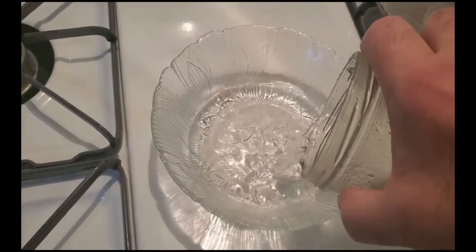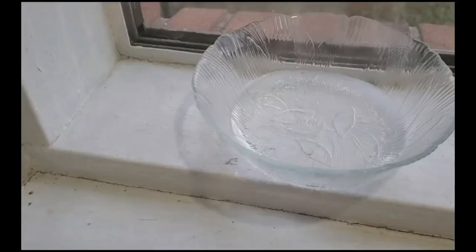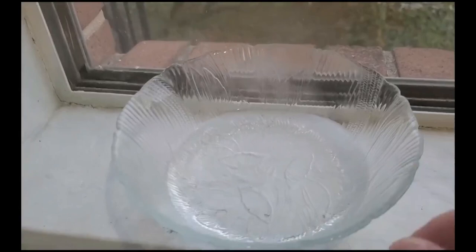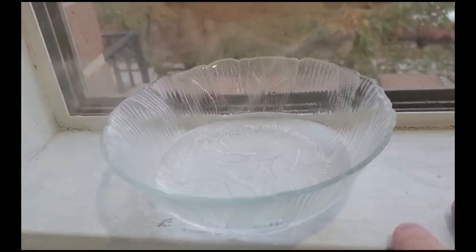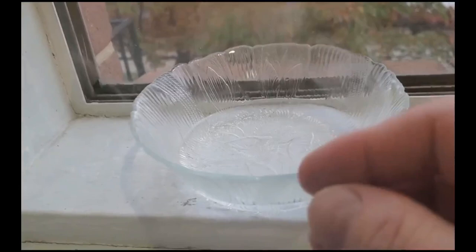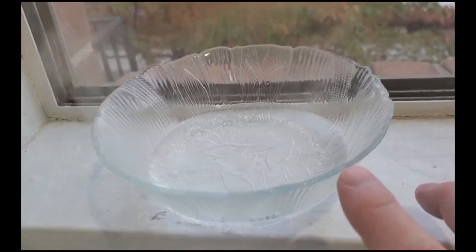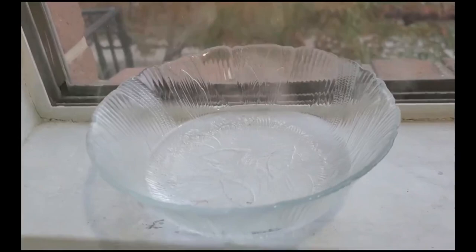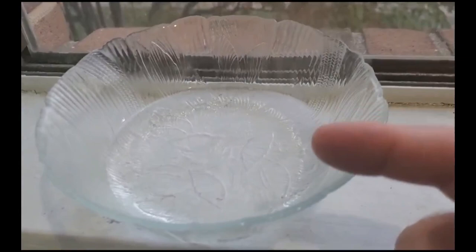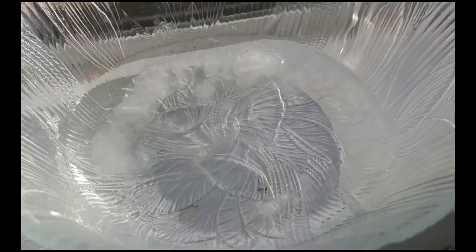Here we have our supersaturated solution. I'll pour it in here — and essentially that's it. I'm moving this to the windowsill. The colder it gets, the less will stay in solution, so they say if you don't have success, try the refrigerator. Since it's becoming chilly and heading toward winter, that should help it along. Crystals should take about two to three days to fully form, but you can start to see them after a day or so.